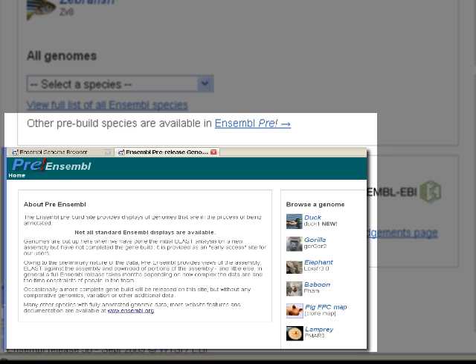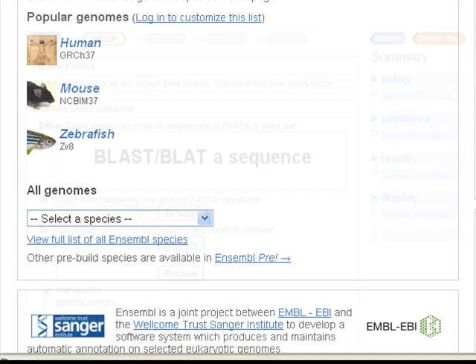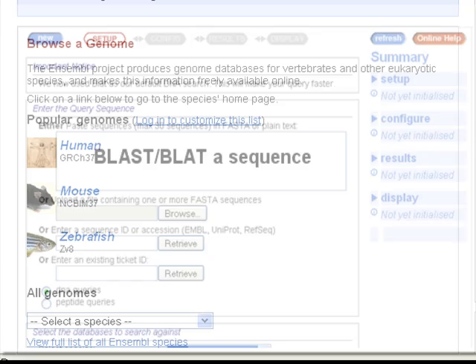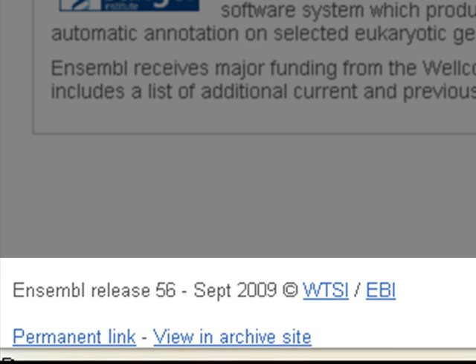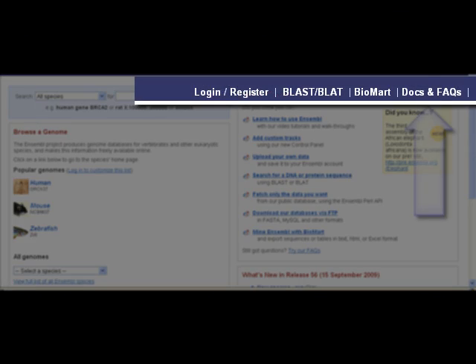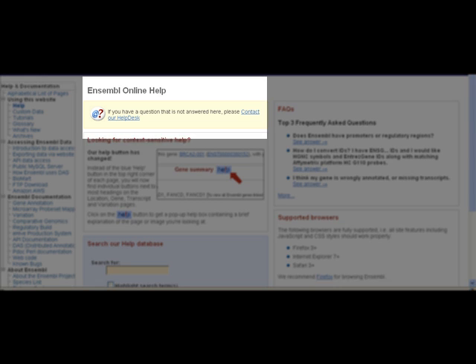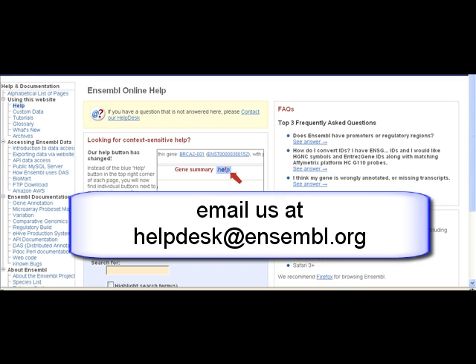The pre-tab allows you to browse new genomic assemblies that have not yet been fully annotated. BLAST is available on both our main site and the pre-site. An archive link is present at the bottom of every page, allowing older versions of Ensembl to be accessed. At the top, find links to documentation and frequently asked questions. Contact our helpdesk with any questions or comments — messages are replied to within 48 hours.